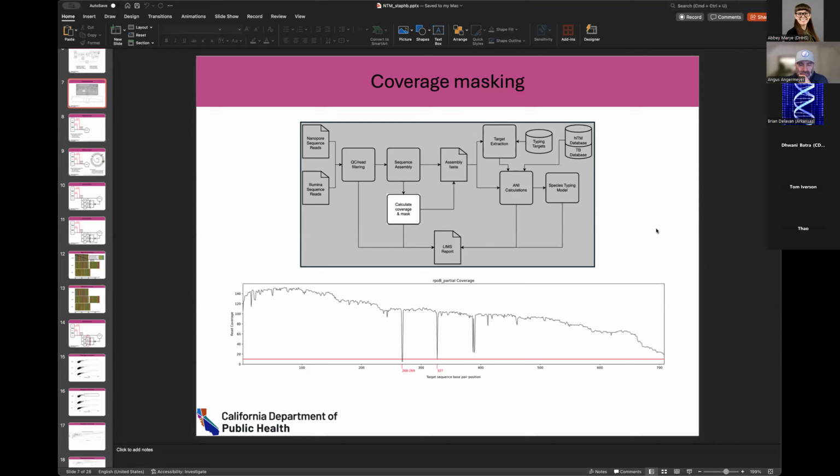Because in this case, it's almost like there's some kind of mixed population in here, some with deletion, some without. Or is it all sequencing errors? It's also interesting how the coverage kind of falls as you go across the whole gene. Maybe it depends on what methodology was used. And you can see this weird dip here that is also similarly problematic looking, but does stay above the coverage threshold. So another problem with thresholds is we're just ignoring that and saying that's great, which is probably not true.